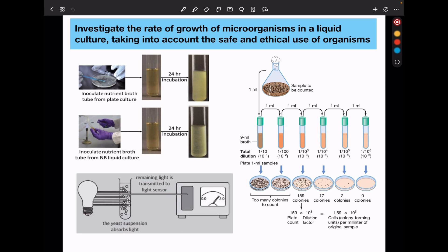Sometimes we can use dilution plating, as seen here — we dilute each time and plate, and in the end we can count the number of microorganisms by looking at the individual colonies. If the colonies can be distinguished completely, that means each colony was originally one bacterium, so we can use that to estimate the number of microorganisms in the original solution. For example, from this plate we can count 159 colonies, meaning 159 bacteria, but because three dilutions were carried out, it is going to be 159 × 10³ cells per millilitre of the original sample.